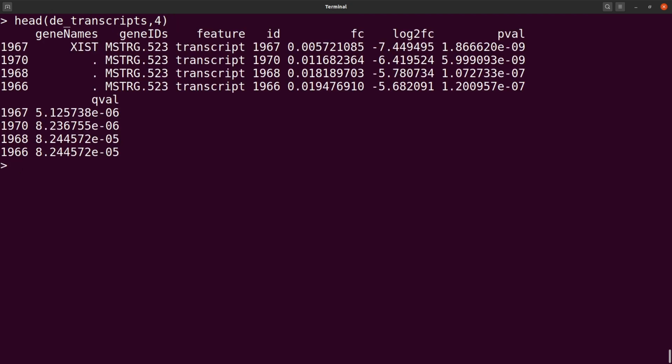Perfect. Let's have it this way. So let me say that in identifying those that are significantly expressed, you need to look at the threshold we will use. Some will use Q values, some will combine Q values and then P values. So this particular threshold, you need to define it yourself. You need to decide it.